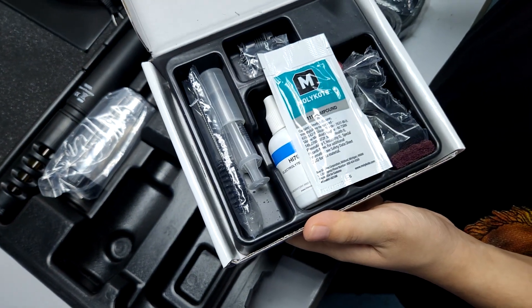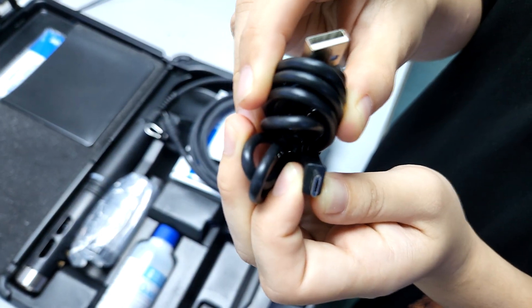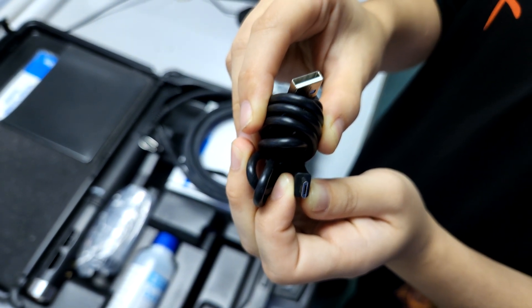Usually you'll finish the whole volume of probe solution after about two years. Also included is a USB, which is not used for charging — it's actually used for data transfer, so do take note of that.